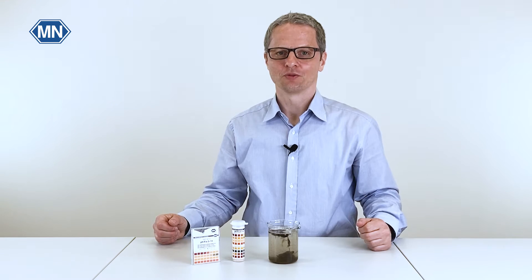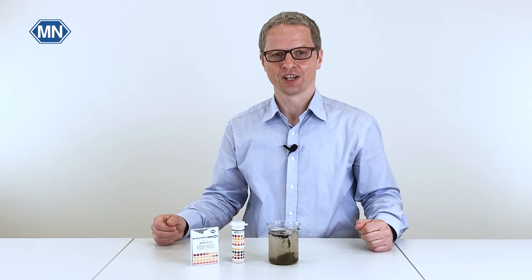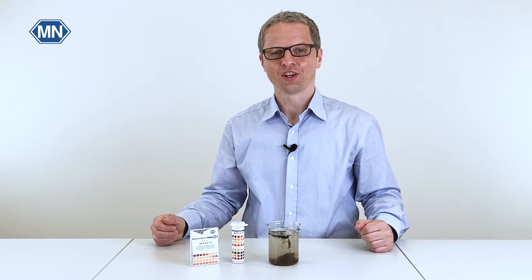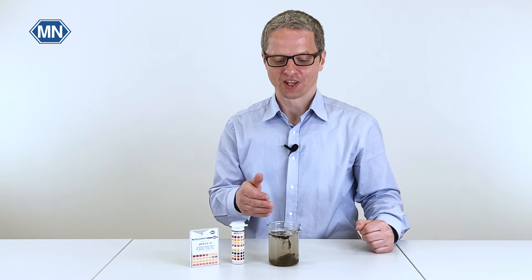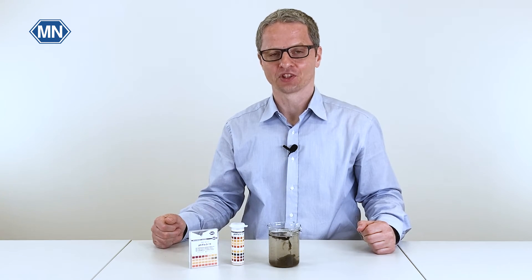Welcome back to our series on pH testing. In this video I will talk about best practices for sampling — in other words, how do you bring the sample in contact with the test strip without changing the composition of the sample.